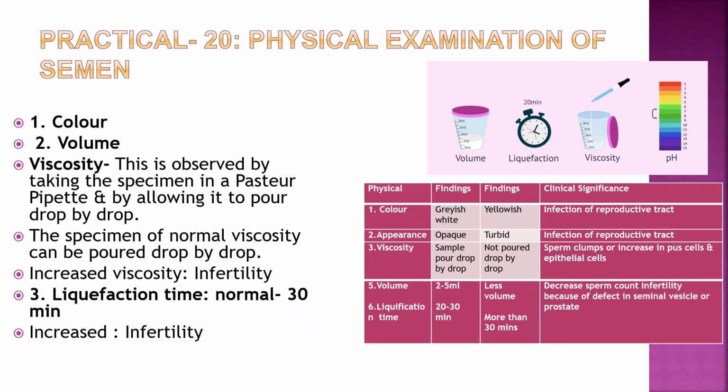Liquefaction time means after collection, the sample is usually a coagulum, and then after 30 minutes, that is half an hour, it liquefies. That is called liquefaction time. Thank you.